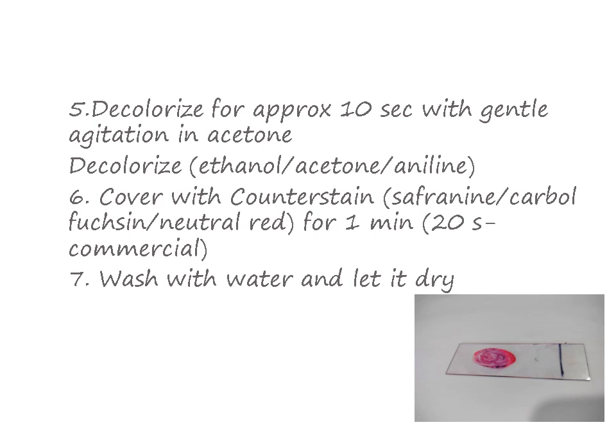There will be over decolorization of the slide. If there is over decolorization, even the gram positive bacteria will lose the stain and appear pink in color. So you don't want the gram positive organisms to appear pink in color. You have to use this time limit very meticulously.